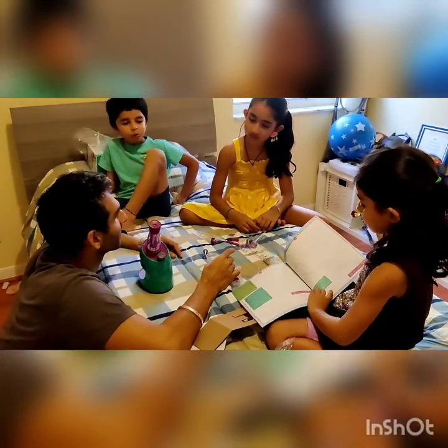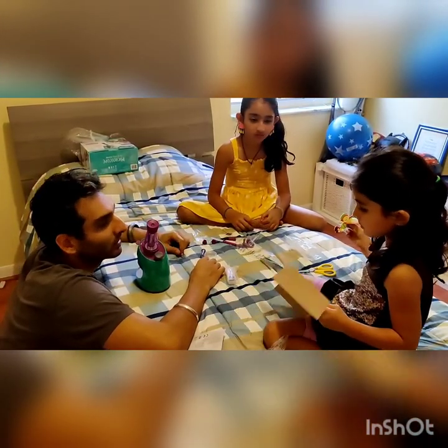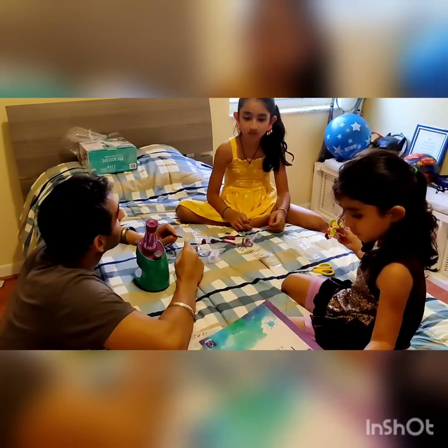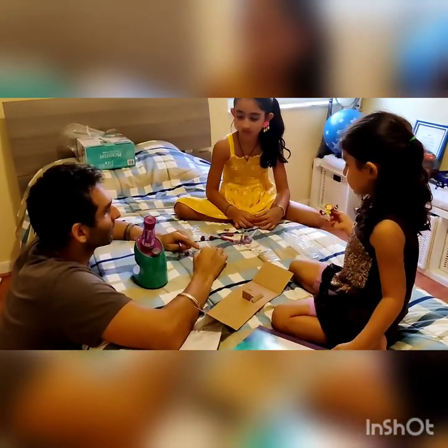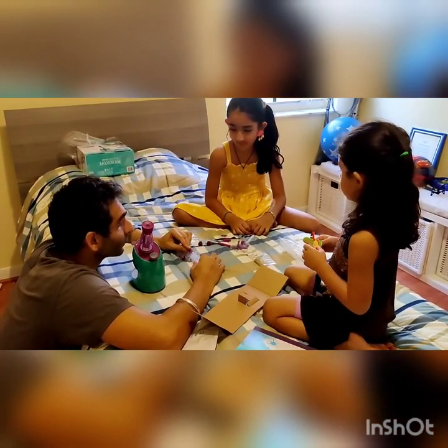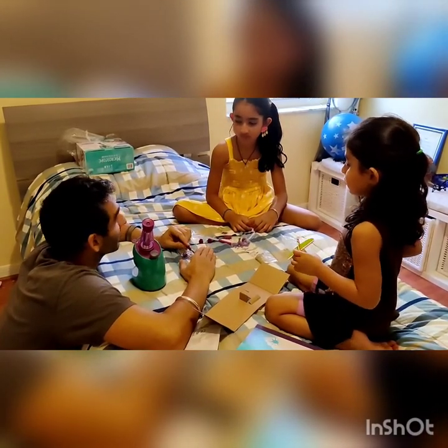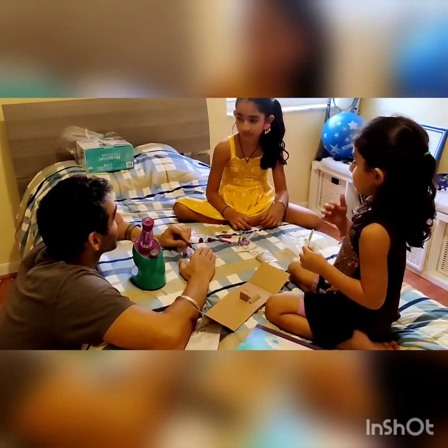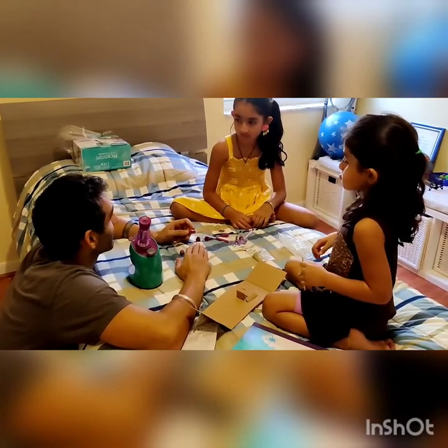There'll be some liquid color in the box, or if it's not there, we'll buy it. That liquid you put on top of the slide. Then you take the cover slip and slowly drop it, but make sure that no bubbles come inside. The color makes the onion become, let's say, purple, because then you'll see it better. Otherwise, it's transparent and you can't see it.